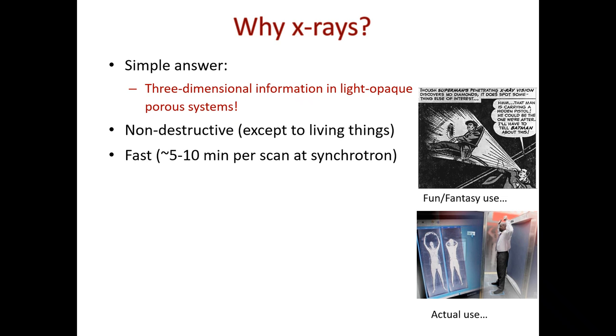So it can be destructive depending on the level of energy used. The one that we are going to see today, if you deliver that type of energy to a person, you will kill a person. So we don't resolve humans to the micron. Okay? We resolve humans only to the millimeter. Now, this is relative information. Synchrotron is a pretty powerful source, and you can get 5 to 10 minutes per scan, even less, especially for materials that are relatively simple, like glass.